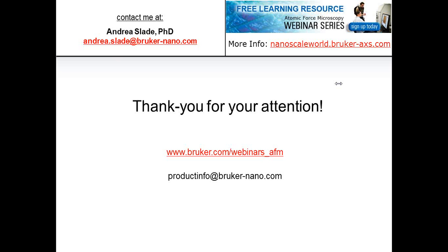And another user of the Bioscope Catalyst asks about these capabilities you've shown. Maybe they have had an instrument for a while, and whether it can be upgraded to what you've shown. I assume it depends, and maybe some of it is a software upgrade. Yeah. So any of the addition of PeakForce Capture, the additional frequencies like the 250 hertz, the 500 hertz, the longer range.